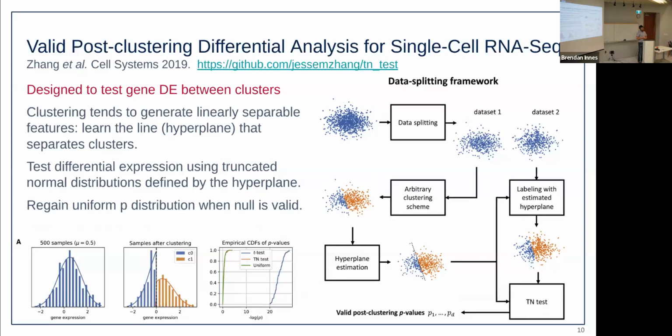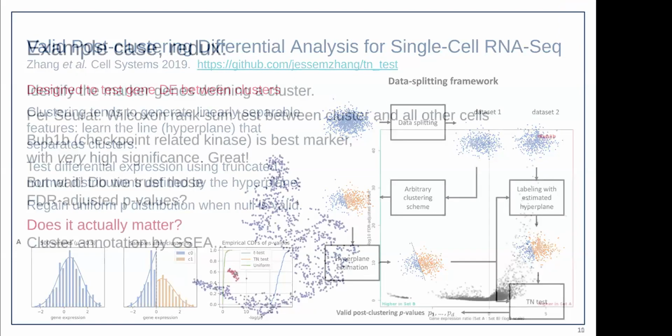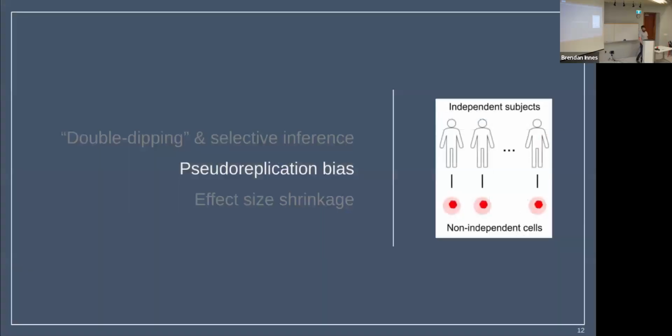And yeah, I don't know. I'm trying to think of whether, so all the differential expression testing benchmark studies, I'm not sure that any of them actually looked at between cluster things. So none of them picked up this double dipping problem, because they would have highlighted that the rank order changed, but I'm not sure that anyone did. So yeah, the answer is I don't know. Okay, cool. Yeah, it would be cool to evaluate it. Thanks. Yeah, maybe I'll do that before I leave.